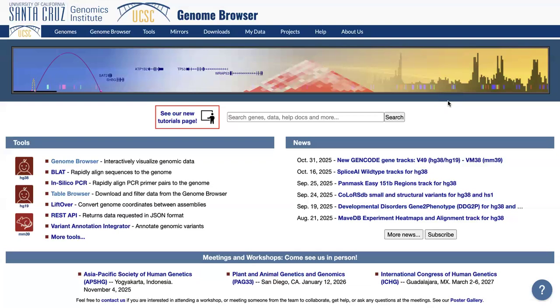So, in this project, I used whole genome bisulfite sequencing to assess DNA methylation and then RNA-seq data to assess the expression levels of TP53, both of which are part of the ENCODE project, which I will demonstrate how to incorporate those filters in UCSC.